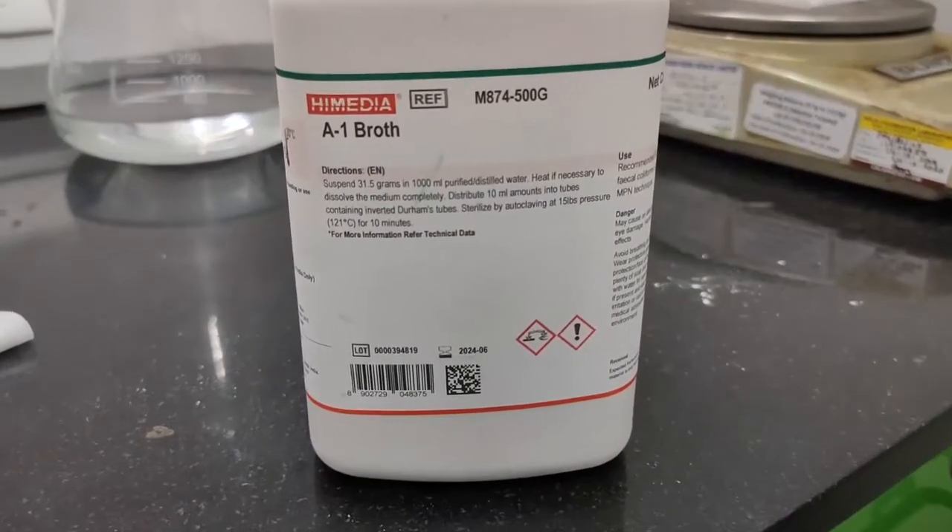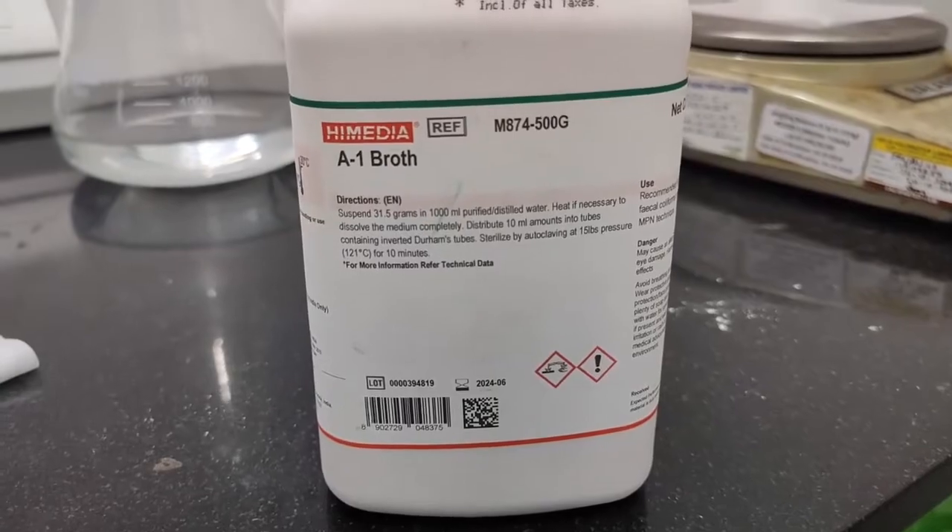A1 broth from high media is used for testing fecal coliform bacteria. This media is recommended by APHA.